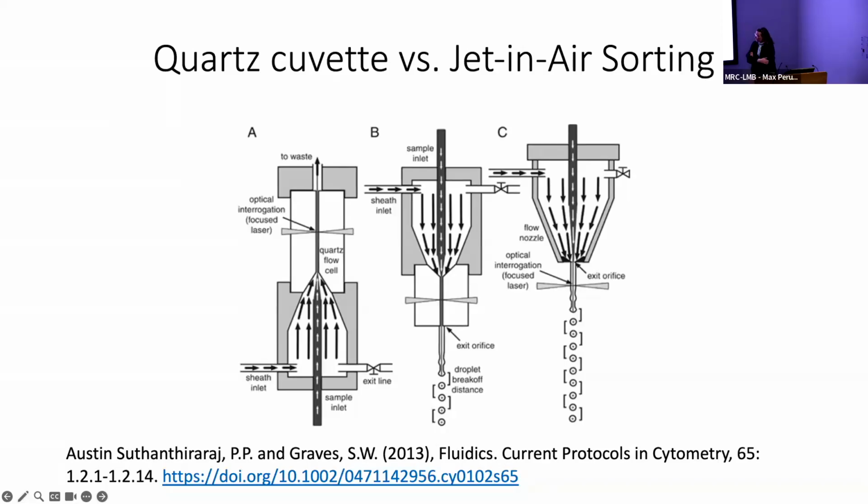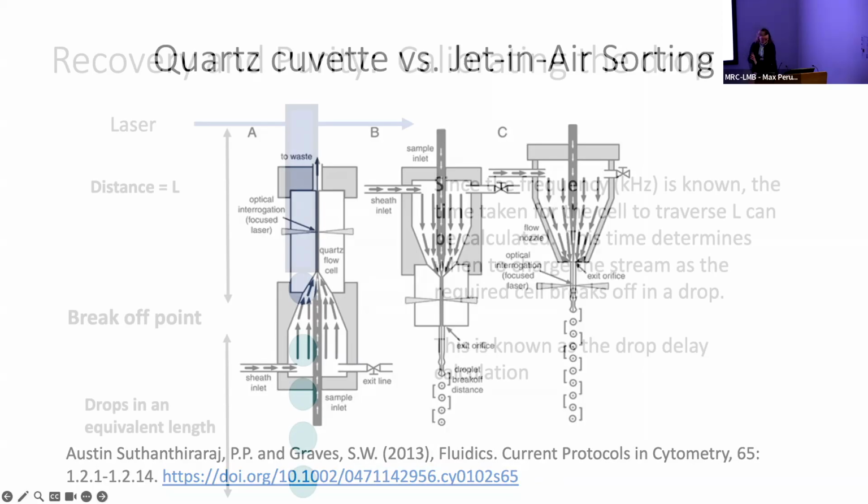And so those droplets are then collected into the various collection devices below. We can use a series of different types of tubes, Eppendorf tubes, larger tubes, 50 ml even, and of course various microtiter plates.